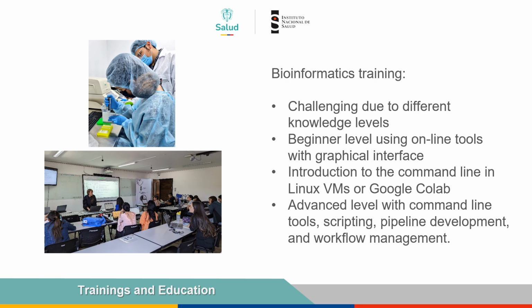However, some of the participants of the genomic characterization network don't have a good bioinformatics level, so we performed different bioinformatics trainings at different levels, some at beginner level using online tools with graphical interface, others using Linux virtual machines or Google Colab to introduce the command line, and other advanced trainings to introduce different command line tools, scripting, pipeline development, and workflow management.